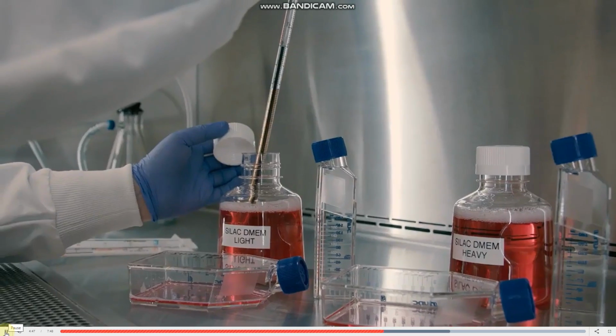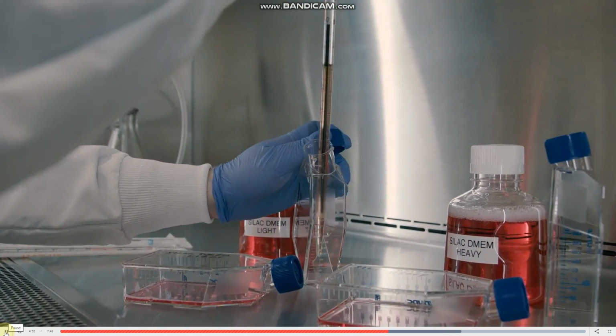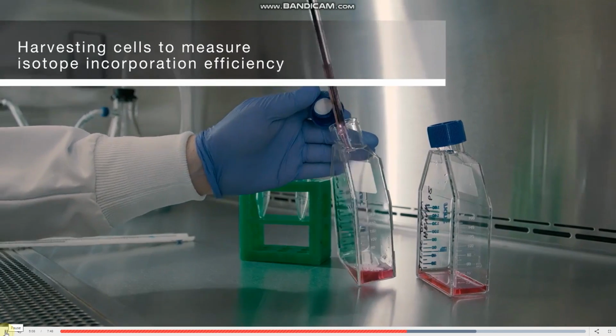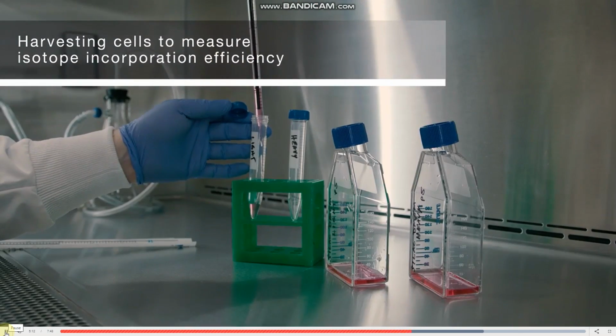Passage each cell population for at least 5 doublings by changing the medium or splitting the cultures as appropriate every 2 or 3 days. Maintain the density so that the cells are actively growing in log phase at 30 to 90% confluency. After 5 cell doublings, the incorporation of heavy amino acids should be greater than 95%. Harvest 1 million cells from each labeled cell population to determine isotope incorporation efficiency.